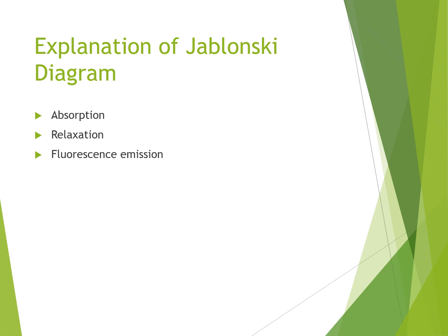So we discussed all the processes in detail. The fluorescence always occurs from the lowest vibrational level of the excited singlet state, as we can see in the diagram, and this explains why emission wavelength is independent of excitation wavelength.